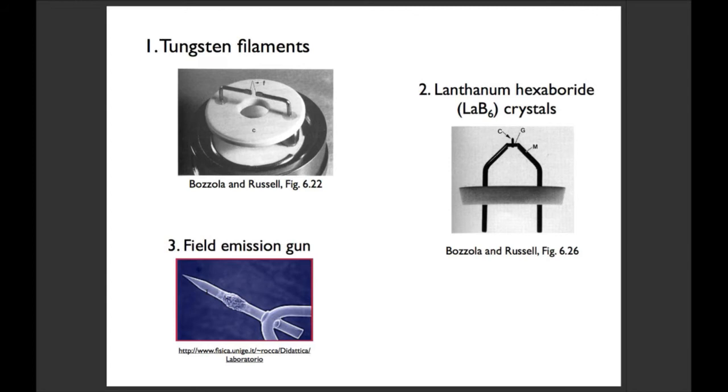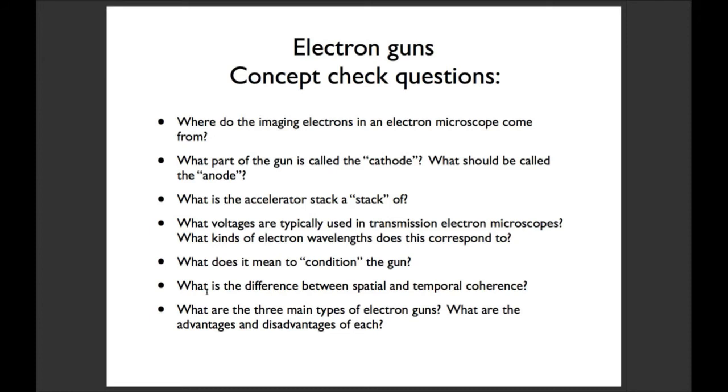But field emission guns are very, very expensive to maintain. You have to apply some amount of heat to them, and so the lifetime varies, and taking care of them can be somewhat subjective, so you just want to make sure that the emission and everything looks right in the heating of these sources. Filaments require regular heating, and it's tempting to warm your filament to be warmer so you have a brighter beam, but it also degrades the quality of that tip more rapidly. So it's about finding the right temperature to operate your electron source at.